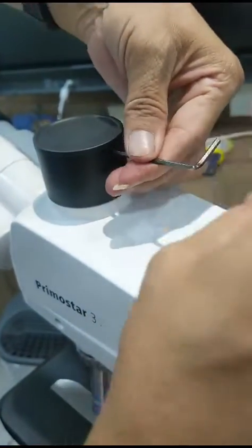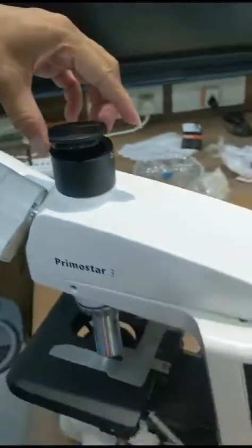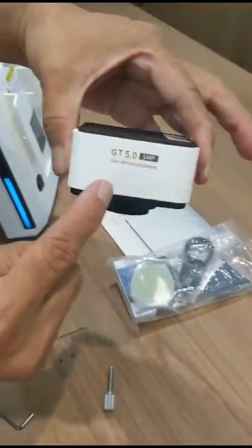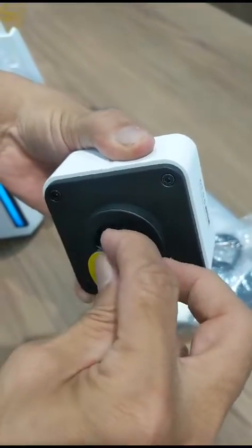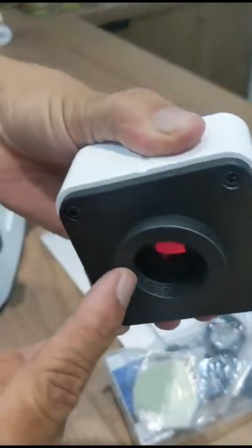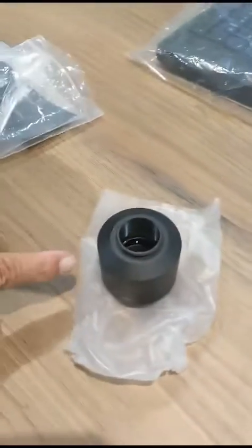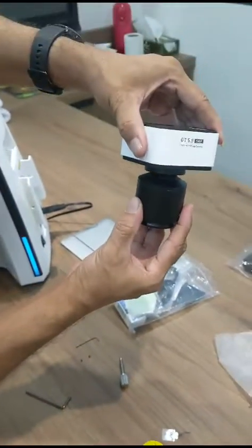At the back side, loosen the Allen screw and take out the cap. Then remove the camera cover cap and also the plastic tape. You can see this tape. This is the C-mount threading. This is the camera adapter — you can see the C-mount threading. Hold the camera like this so the dust falls below.